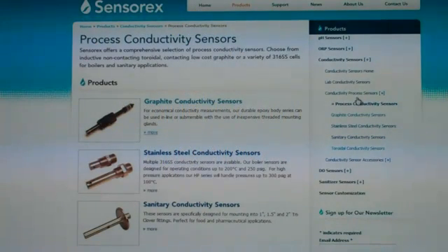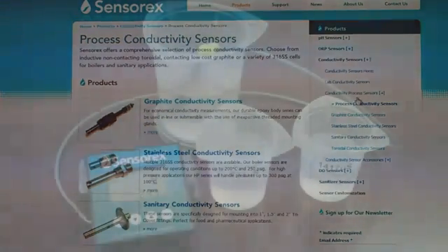Conductivity electrodes must be calibrated with the instrument the very first time you use it to take a measurement. They should also be recalibrated when you suspect the sensor may be out of calibration, or on a periodic basis to verify that your calibration remains accurate. I'm Joe Uack with SensorX. Join me as we learn how to calibrate a conductivity sensor.